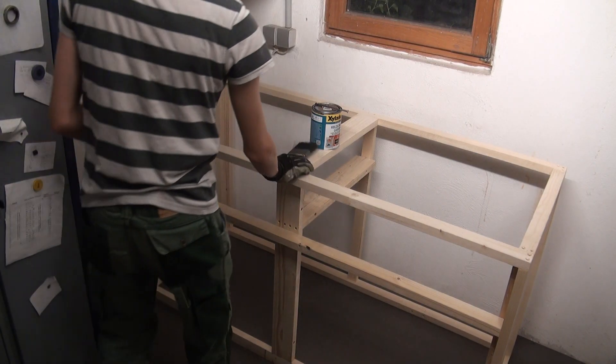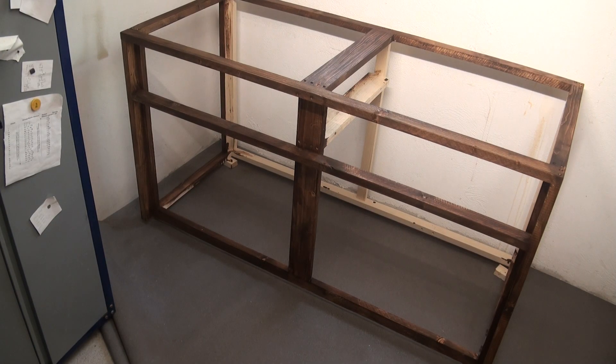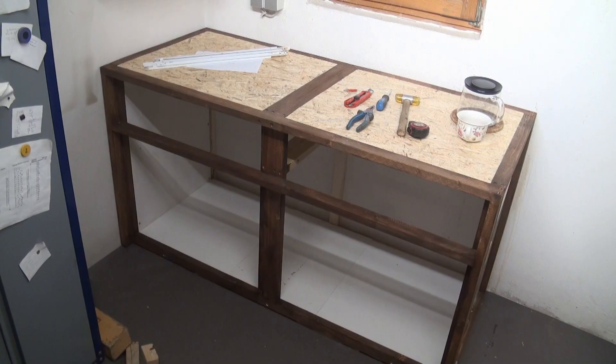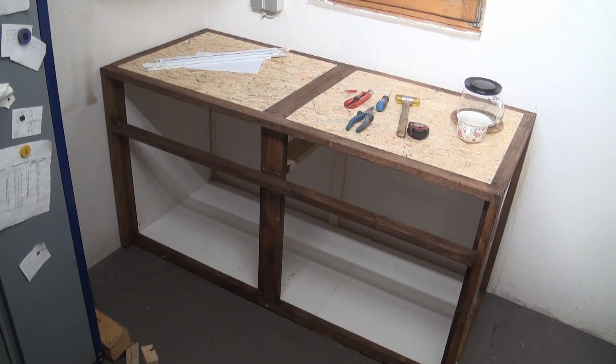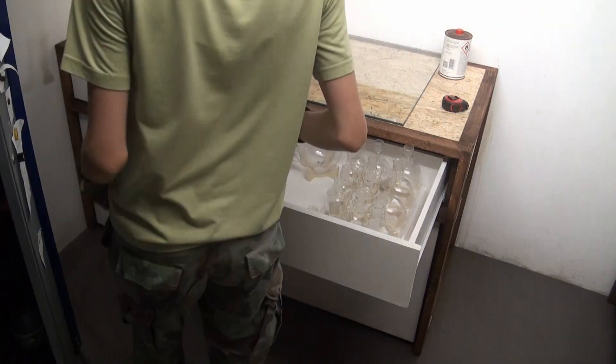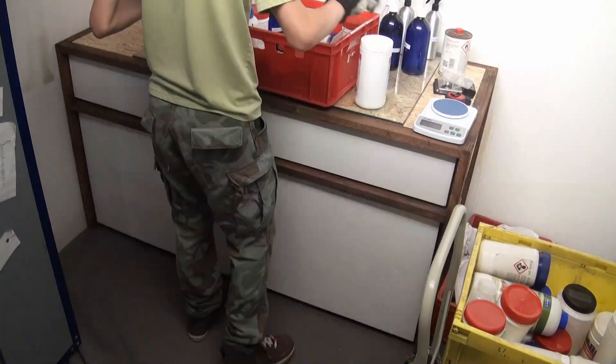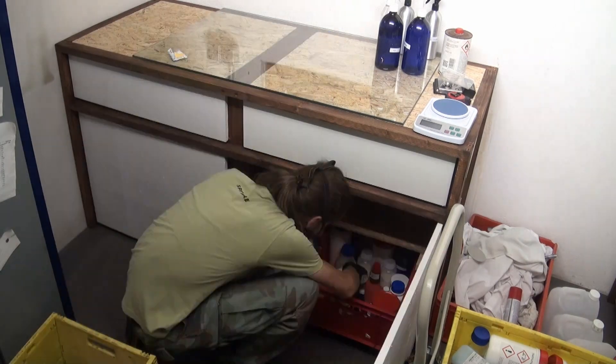Building the laboratory workbench was pretty much the same. I started by firstly constructing the rough frame and then added the same dark wood stain. After that I added boards for the work area, which I left unpainted and unstained, because I kinda liked the look of it. Next, side panels, drawers and cabinet doors were added, and that was about it. Well, to be honest, that wasn't it — I still needed to put back all of the glassware, random stuff and chemicals. Especially the chemicals took quite a while, because I had to sort all of them.